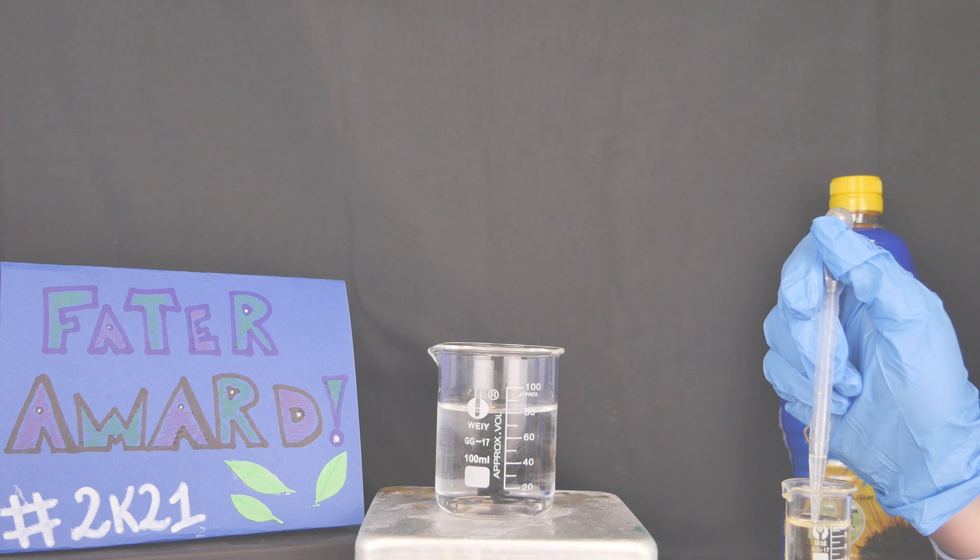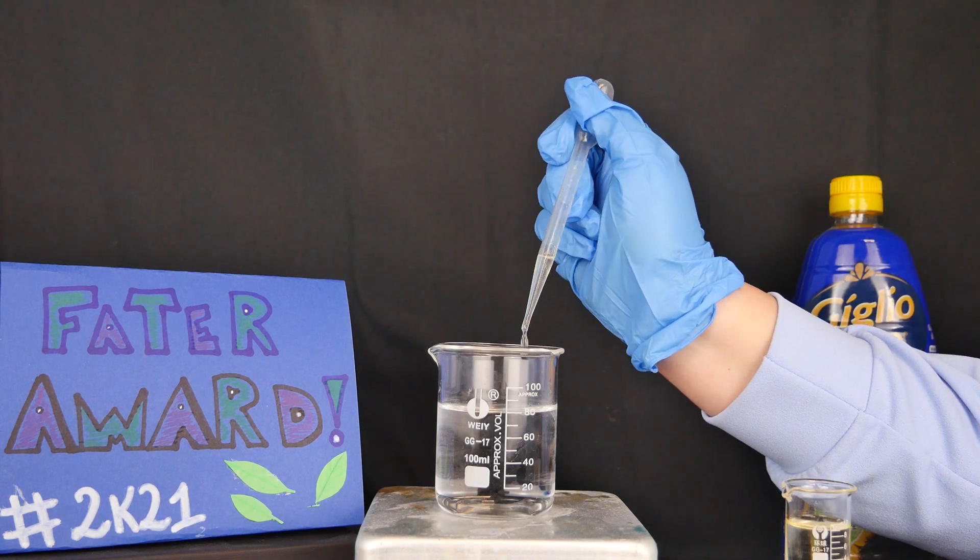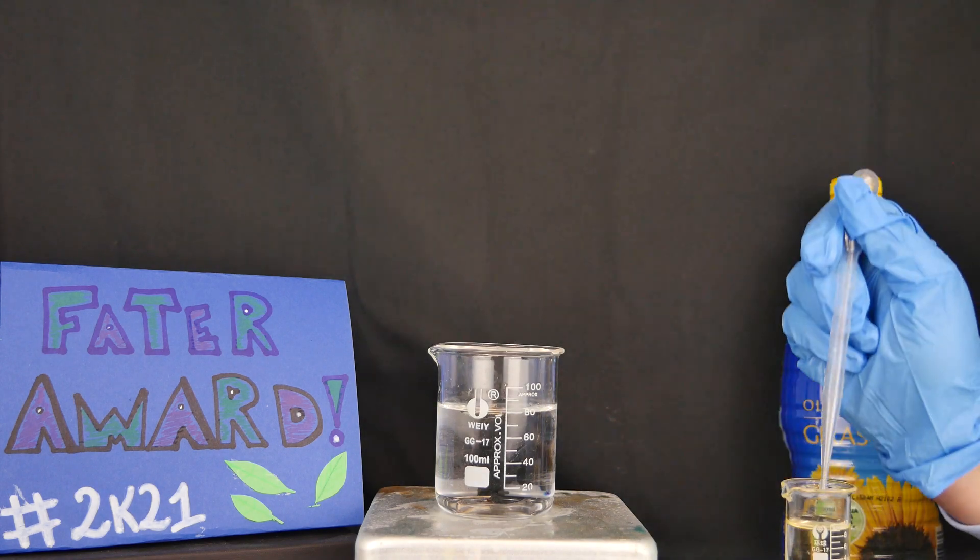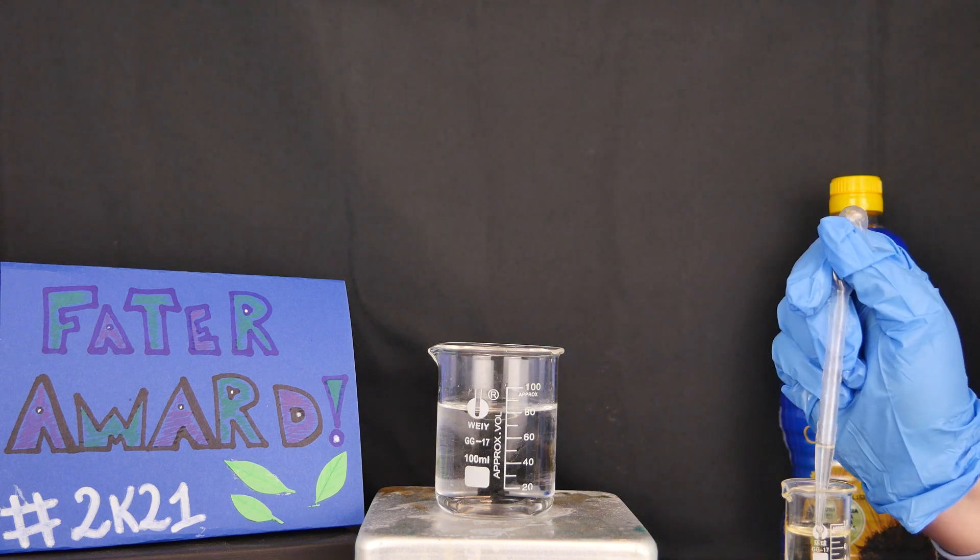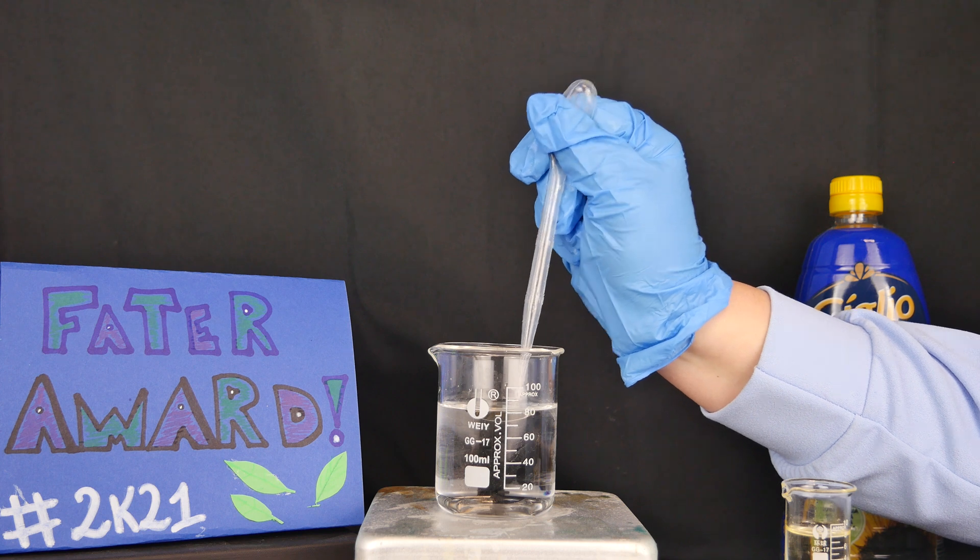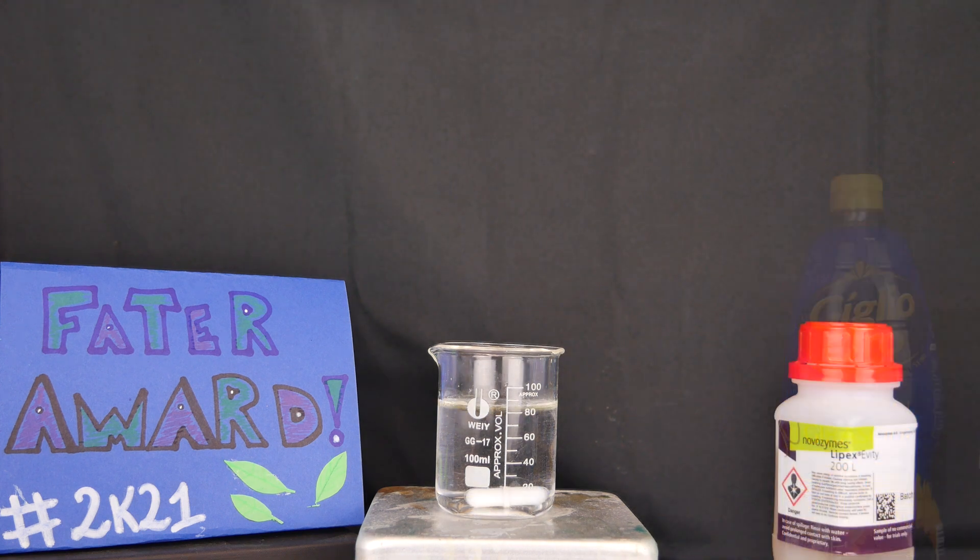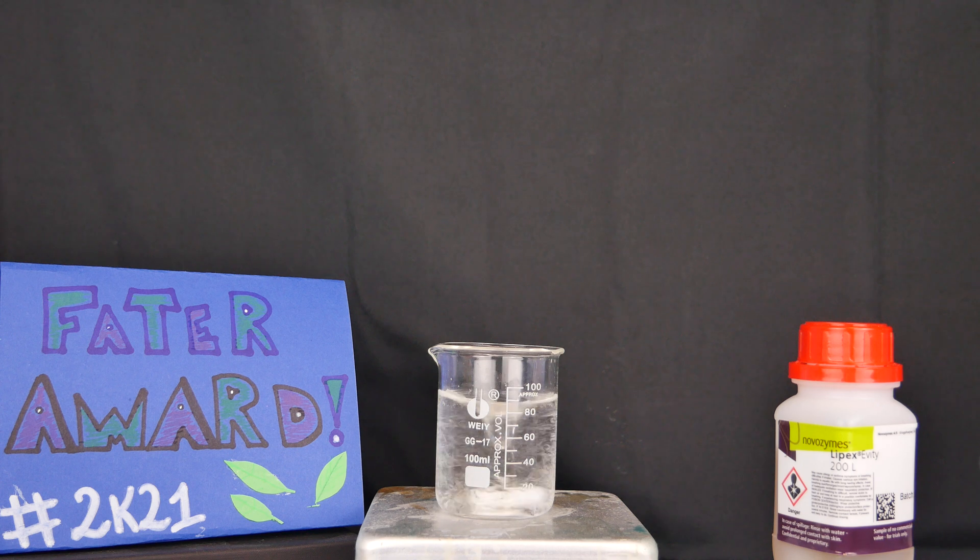To start, add some oil or fat to a beaker containing tap water. In this way we are simulating the greasy condition in dirty clothes. Furthermore, in our case we have vigorously stirred our mixture to recreate the washing condition that's set up in a classic washing machine.